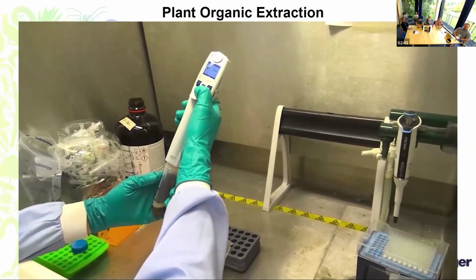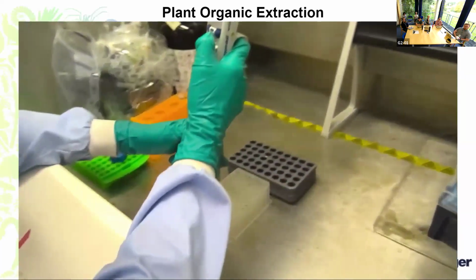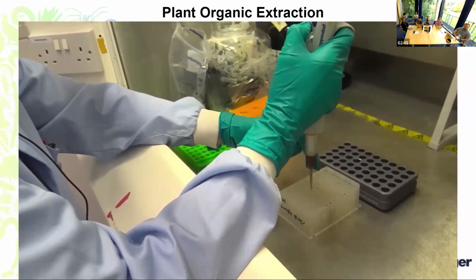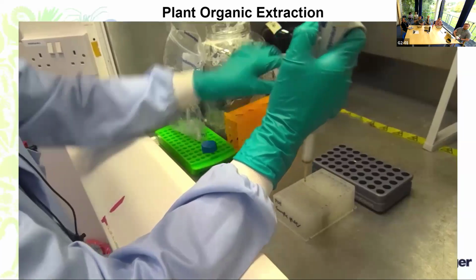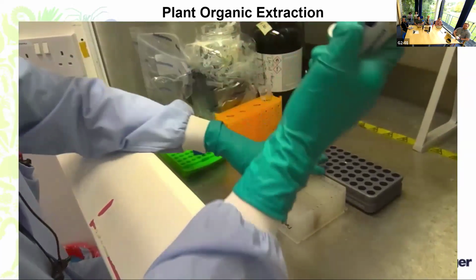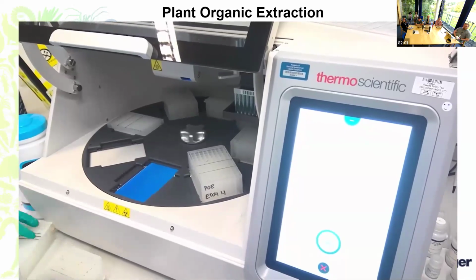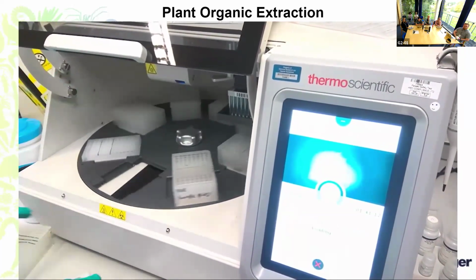Okay, here is the Ceramag SpeedBead solution. So this is primarily used to capture the DNA out of the aqueous phase and remove any residual contaminants. Yep, so then we proceed to the automated extraction on the KingFisher. The beads are magnetic based, so that is how this operates.